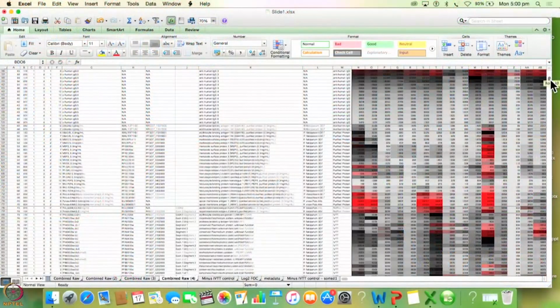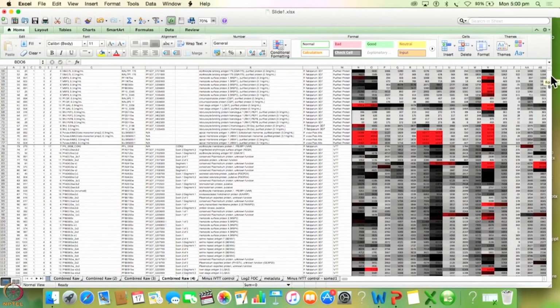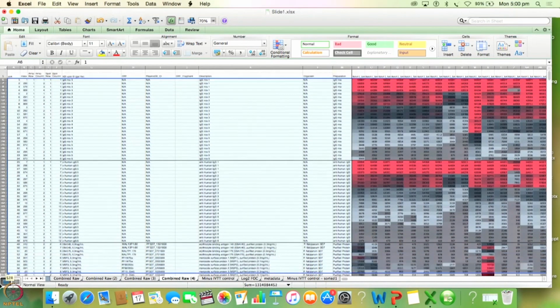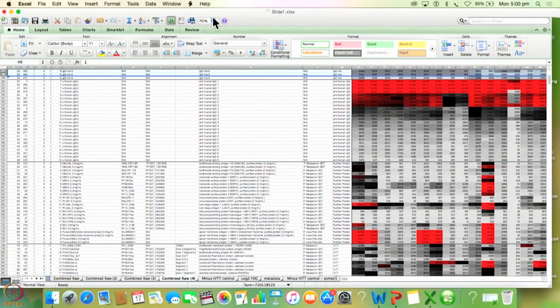So again we're going to come back to the same Excel. It is color coded and we've reached this stage. In this data we have IgG mix, anti-human IgG, and purified proteins. We don't need any of those right now for our analysis. We are going to directly go down to the IVTT spots. So in fact we'll probably just delete those rows to avoid confusion. So let's start from here. I'm going to delete the first few. Maybe I'll just zoom this a little bit.